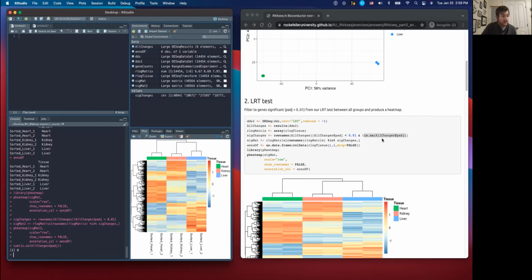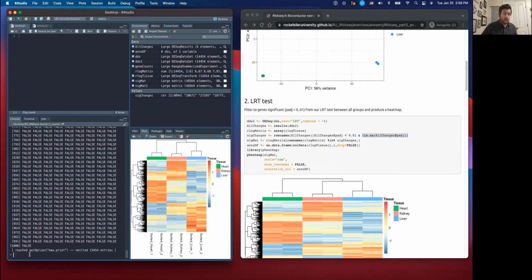In this data set, actually, though, I think I must have already filtered out the NAs previous to putting it on GitHub. So yeah, there isn't any NA. So when I asked sum is.na, well, this is a bunch of TRUEs and FALSEs. If you do sum, it counts how many are true. So there's no NAs.